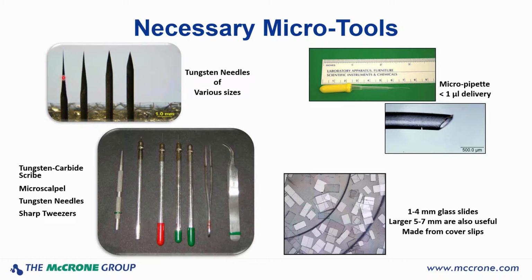I personally very seldom use a fine needle because I'm too heavy-handed and I bend it. But you may be able to use that, and there's certainly some applications that would make life easier. You can make these angled. You can make hooks on them. We've made some that actually are scoops, almost like a mini spatula. So you can do all kinds of things once you learn the techniques.